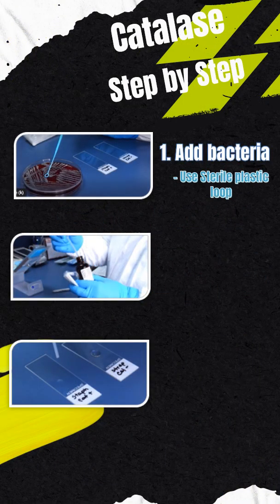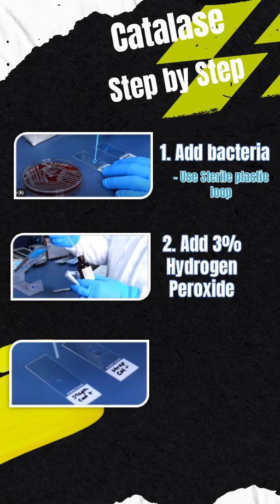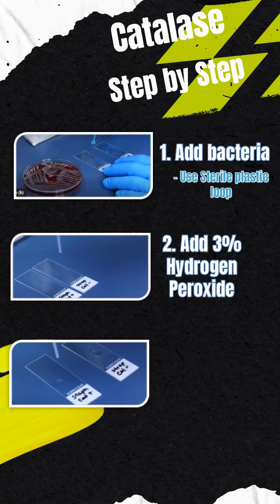Take a small amount of bacterial colony using a sterile loop and smear it onto a glass slide, or place it in a test tube. Add a drop or two of 3% hydrogen peroxide to the bacteria and immediately observe for a positive reaction.